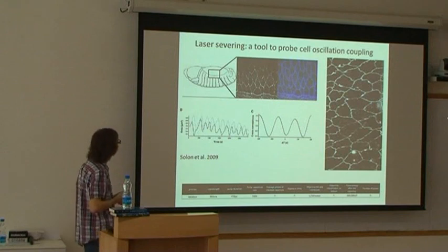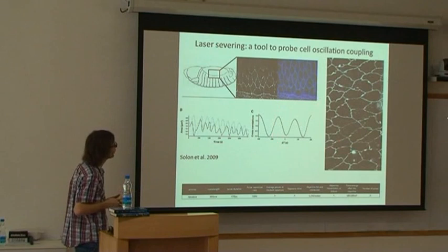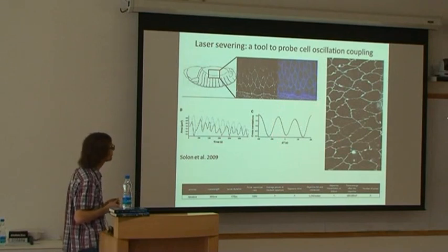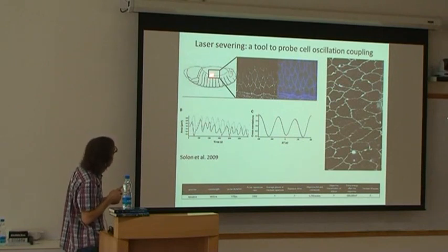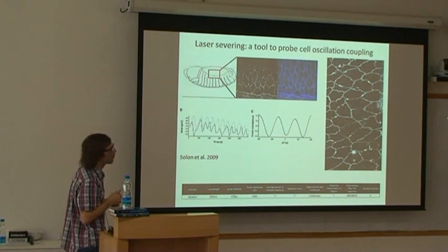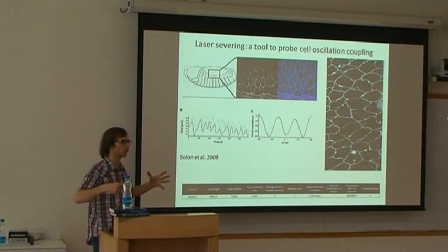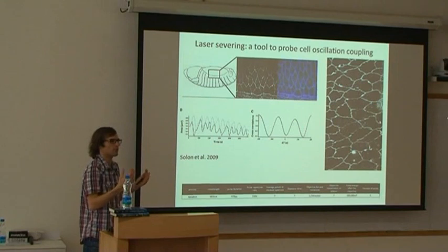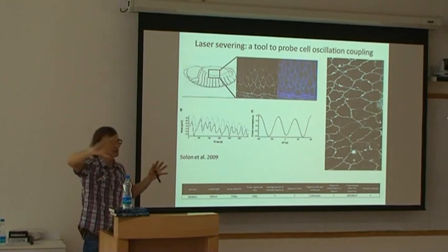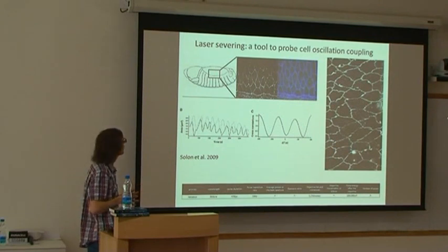Okay, so I present to you this other work where at one point Solon decided to use laser dissection. This was done at the MBL with Damian Brunner. Damian Brunner was very interested in studying the process of amnioserosa contraction. So the Drosophila at an early stage has different tissues, one of which is on the dorsal side. And this tissue is an accessory tissue because it will be there during the germ band extension we saw, and will play some role that probably has still not been studied.